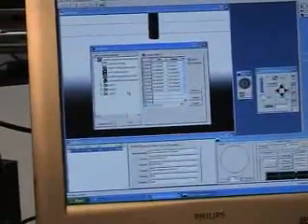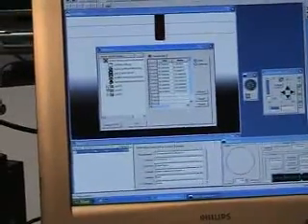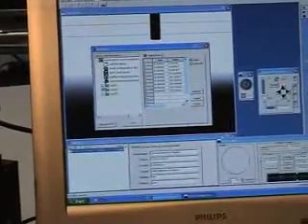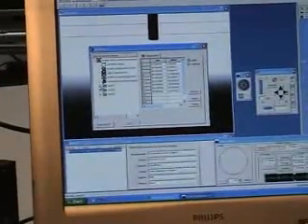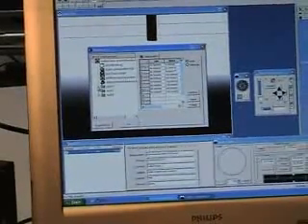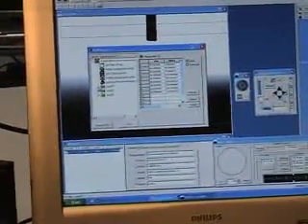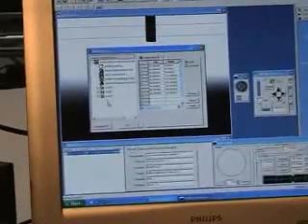Now we have completed the coordinate system, the measuring points, and we will start now automatically a measurement.